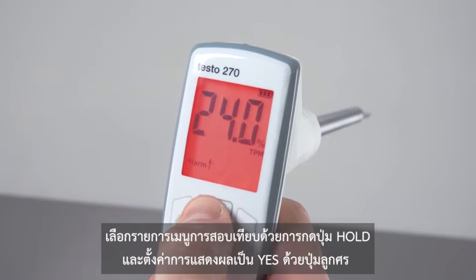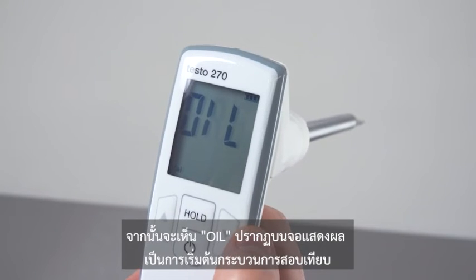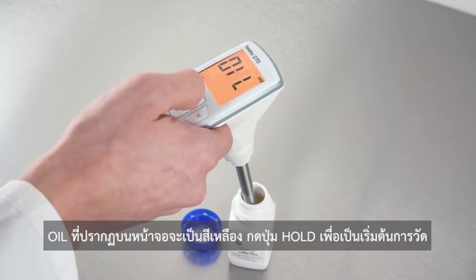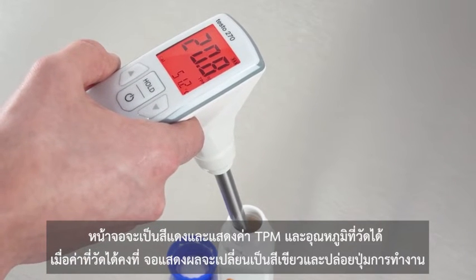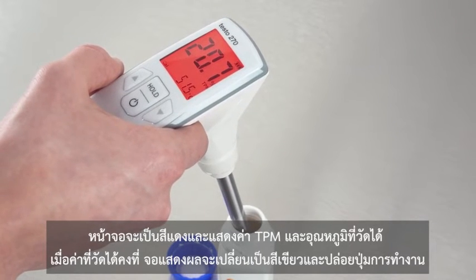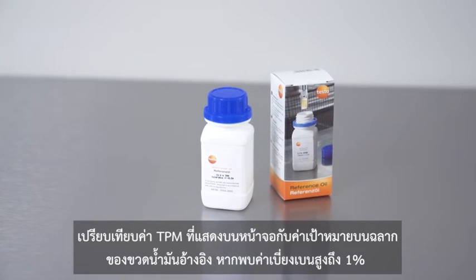You will now see 'oil' in the display, which means the calibration process has started. Now place the sensor of the measuring instrument in the heated reference oil. The oil shown in the display lights up yellow and the measurement is started. With hold, the display lights up red and the measured TPM value and temperature are displayed. As soon as the measured values stabilize, the display lights up green and the operating keys are released.